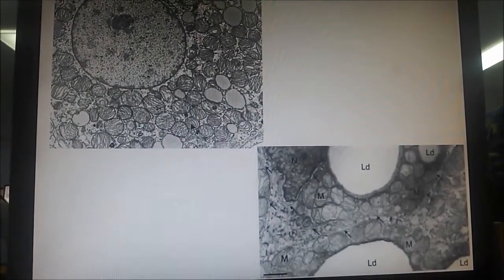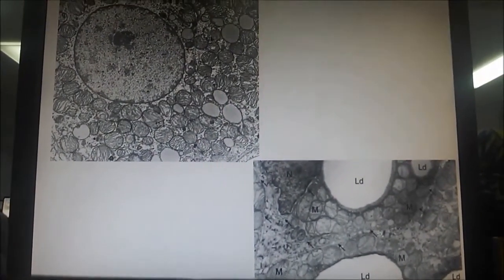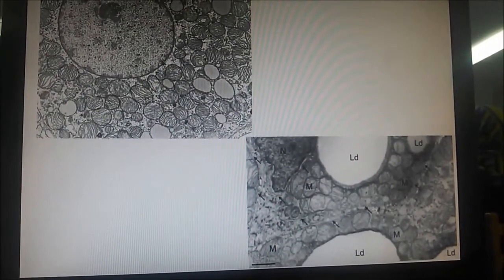Any section to the left, this is an electron microscope, right? Transmission or scanning? Transmission, you can see nuclei and organelles. Now, regarding the cell, of course you need to know that this is brown adipose. How do we know? As usual, we work systematically. You look and here you have a cell under the microscope.